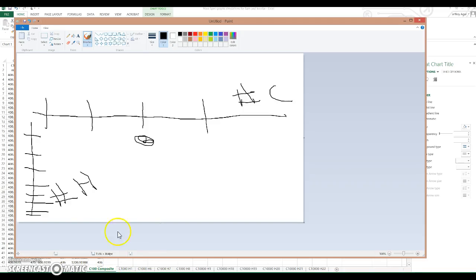And where they're going to feed in is down here. Final is composite. So this will be like, here's all these different possibilities where the protein could be, but if you add them all together, they make this gorgeous little composite. So I hope this makes sense.